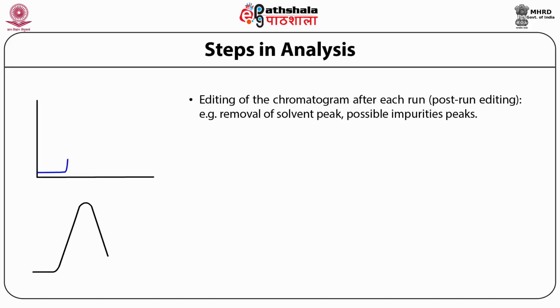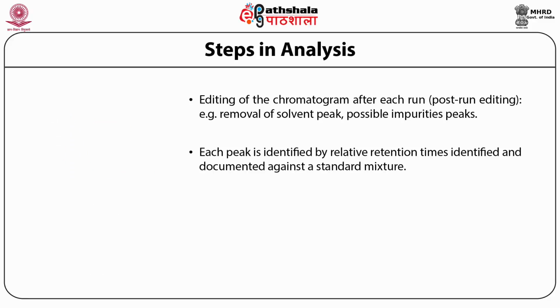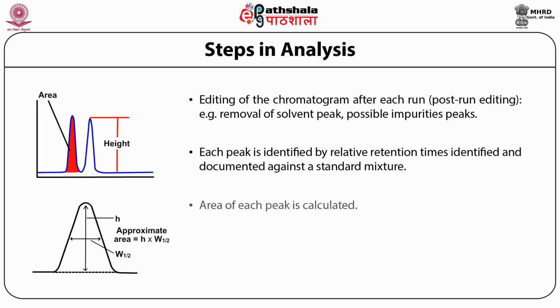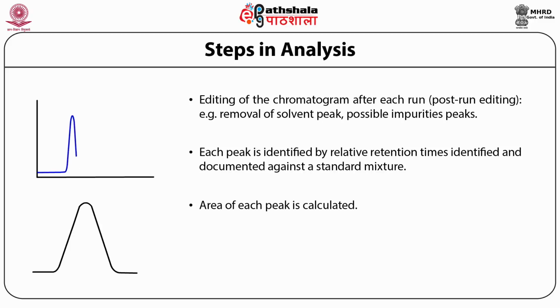And once this has been edited, then each of the peaks is identified by their respective retention time and documented against a standard mixture, which we just said is a mix of pre-identified components. Then the total area of the peaks will be given by each. Of course, nowadays the software is sophisticated.